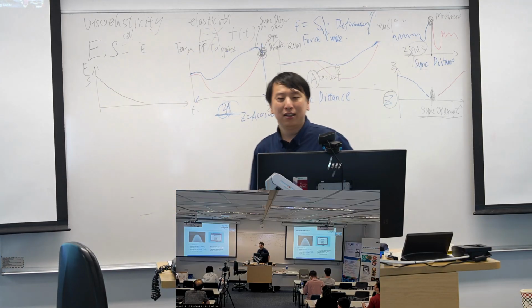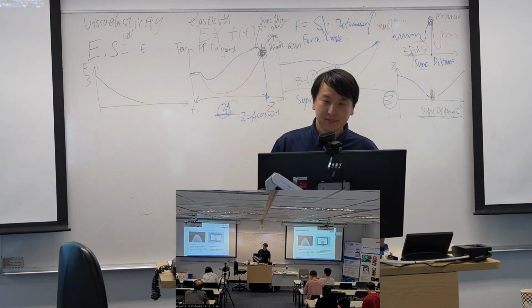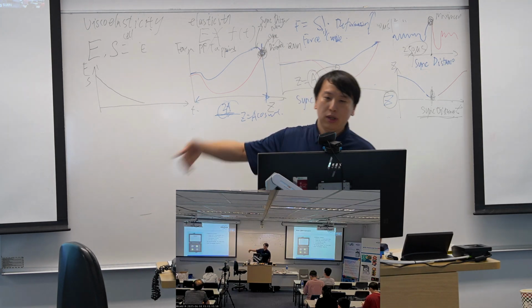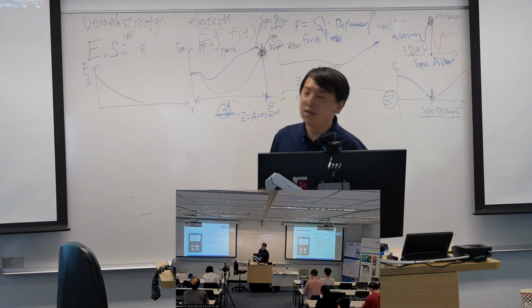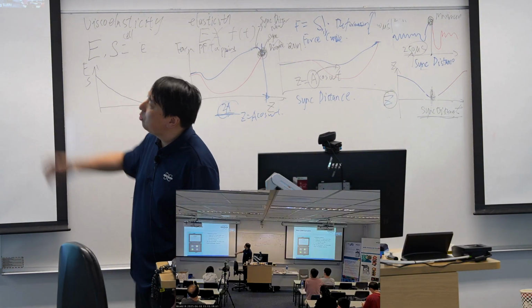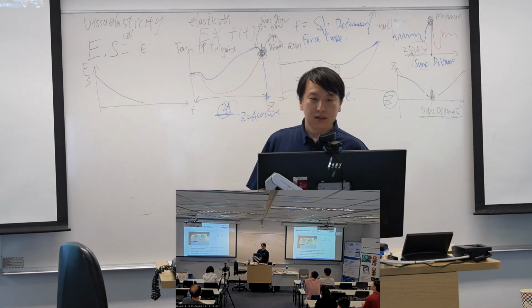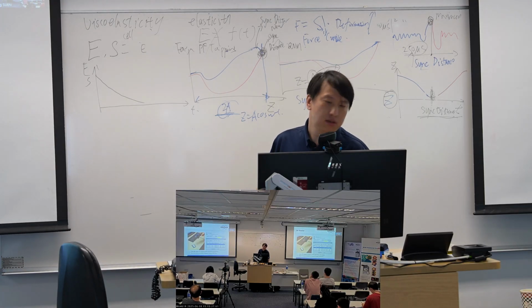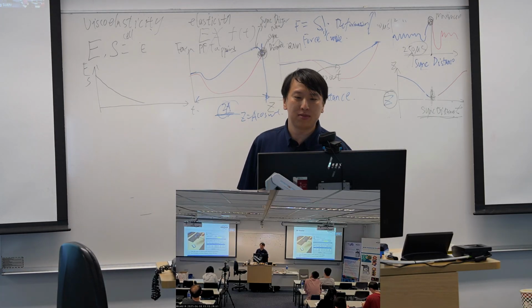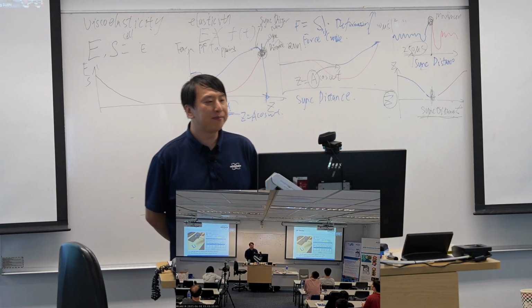It makes the calibration easier. And we have various reference samples, as we explained in the morning. We use those for the relative method. So that's about the software stuff, and we can show you in the hands-on session.